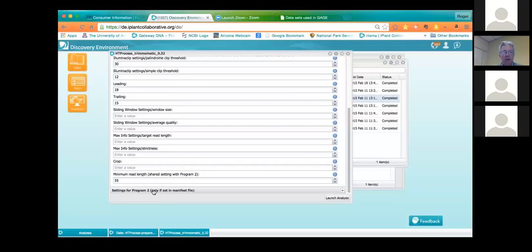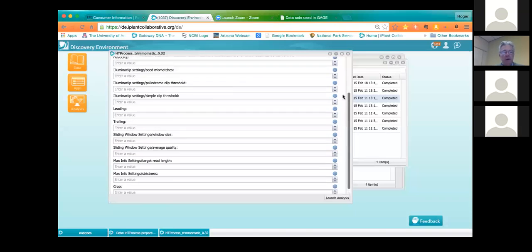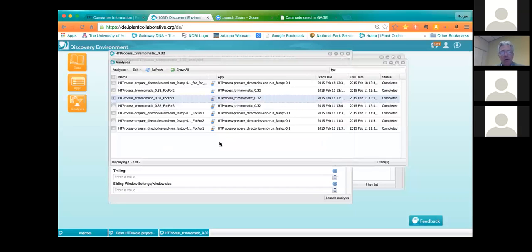But you'll notice down here, there are a whole different set of boxes. And that's for program 2, program 1, program 2. What is that about? Well, let's go back, well, let's open this one up for now.